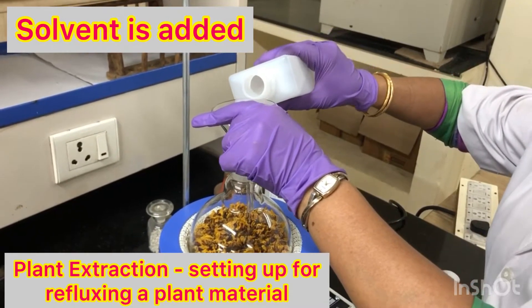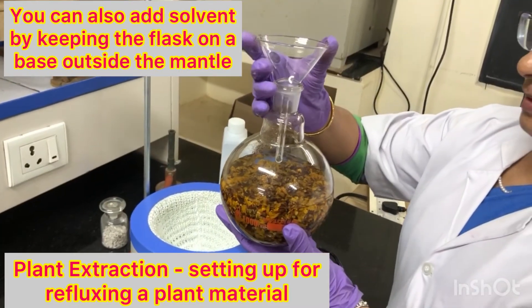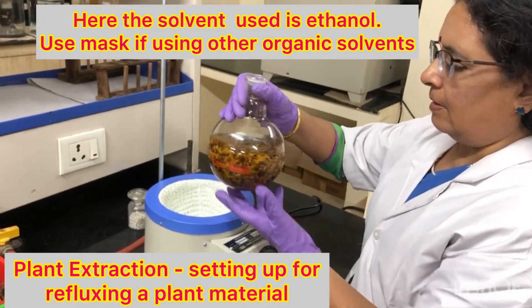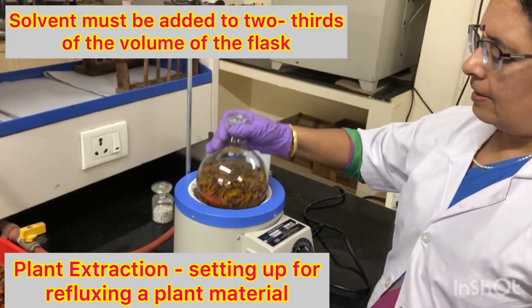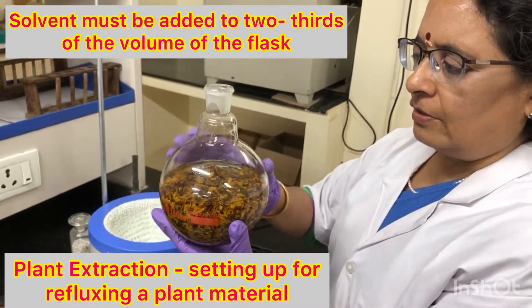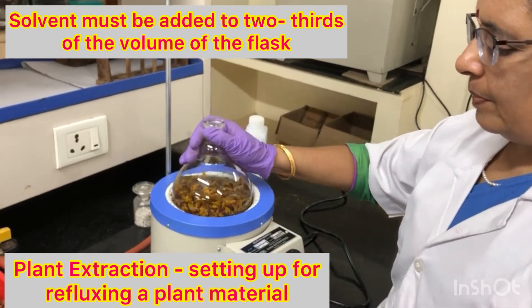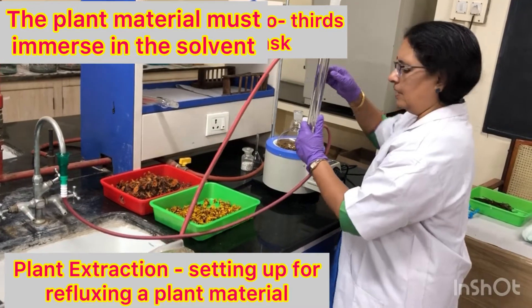I have added ethanol into this — I'm going to make an ethanol extract of this flower. You have to measure the solvent and add just enough to immerse the plant material, not too much. You have to keep one-third of the space free for the solvent to boil, go as vapors, and condense down the condenser.